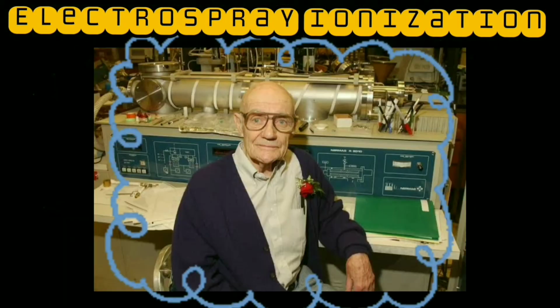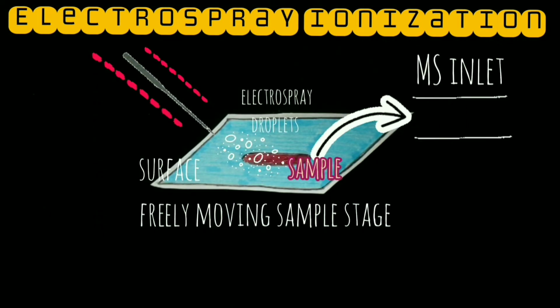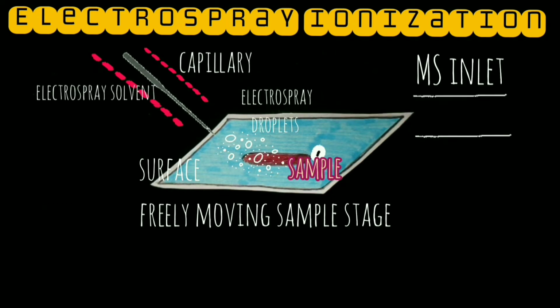John Fenn introduced the electrospray ionization method. During standard electrospray ionization, the sample is dissolved in a polar volatile solvent and pumped through a narrow stainless steel capillary. A high voltage of 3 or 4 kilovolts is applied to the tip of the capillary.